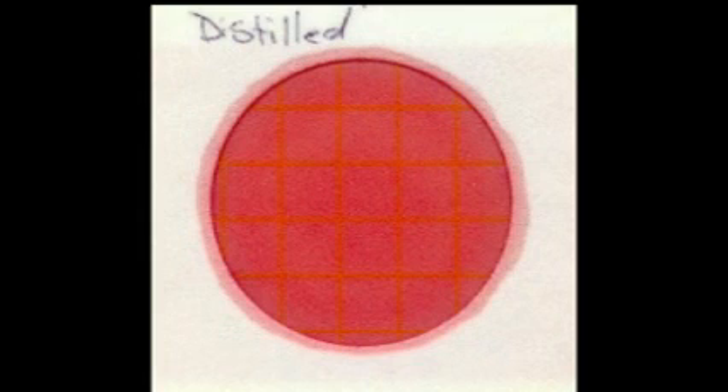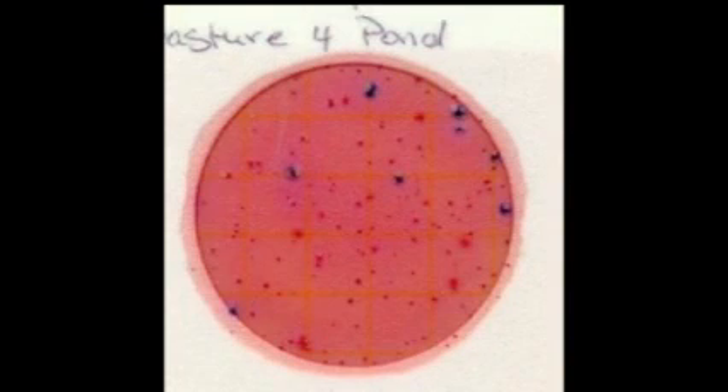This first plate is an example of one in which there are no bacteria growing — either soil coliform, which show up as pink dots, or E. coli, which show up as blue dots. The second petri slide is of a pond which contained eight E. coli colonies. These are the blue or dark purple appearing dots on the slide. The soil coliform are the pink dots on the slide, which are normally found in any surface water. It merely indicates that soil is in the water.